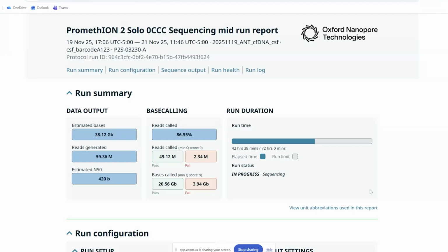It does concatenation, but it also produces some statistics that we use in some of the workflows that we stream. We have some groups that do it every 10 minutes or every minute or something, so there are thousands of FASTQ files and BAM files. And I think concatenating BAM files in particular is kind of a pain.